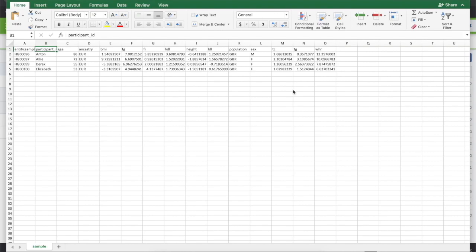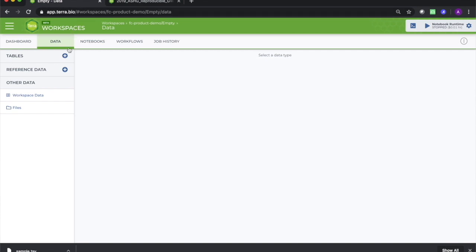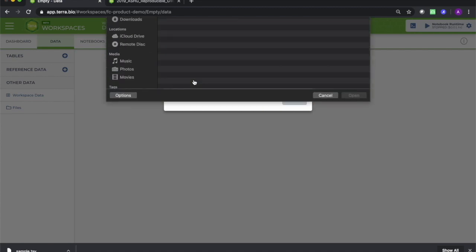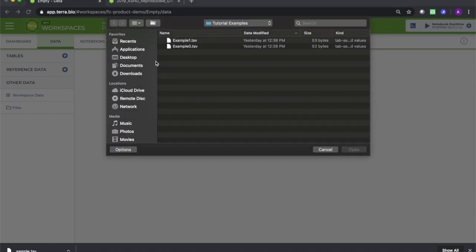Now click the plus icon in the data table section as described earlier and upload each file in the necessary order. In this case, the participant ID entity type comes first, then the sample ID entity. Make sure to click the create associations checkbox.